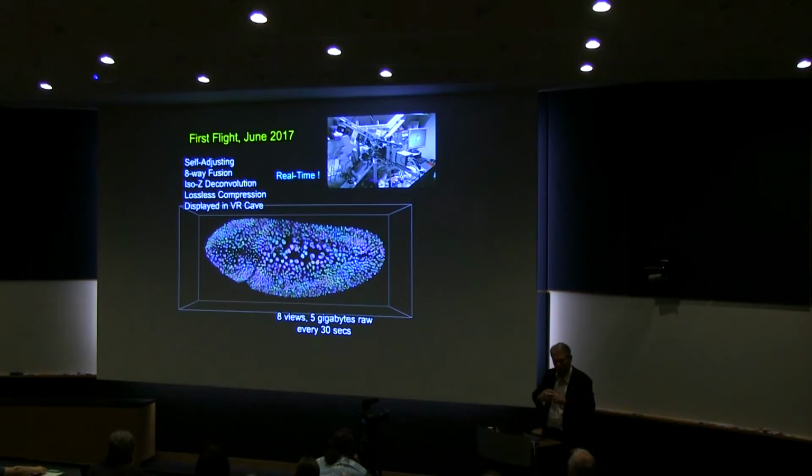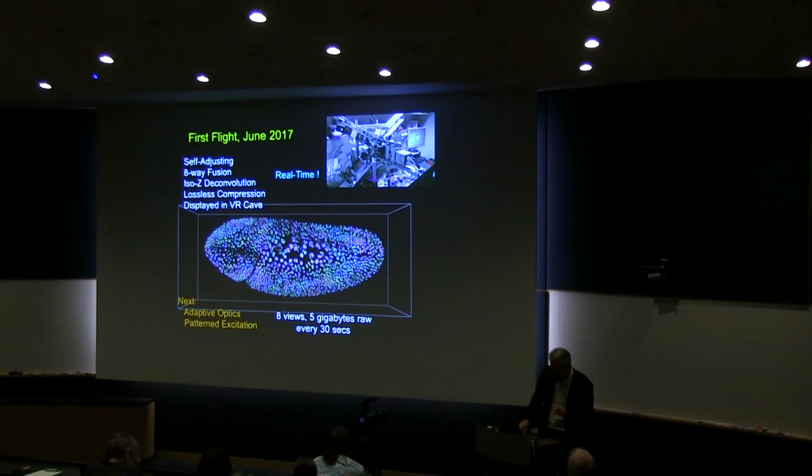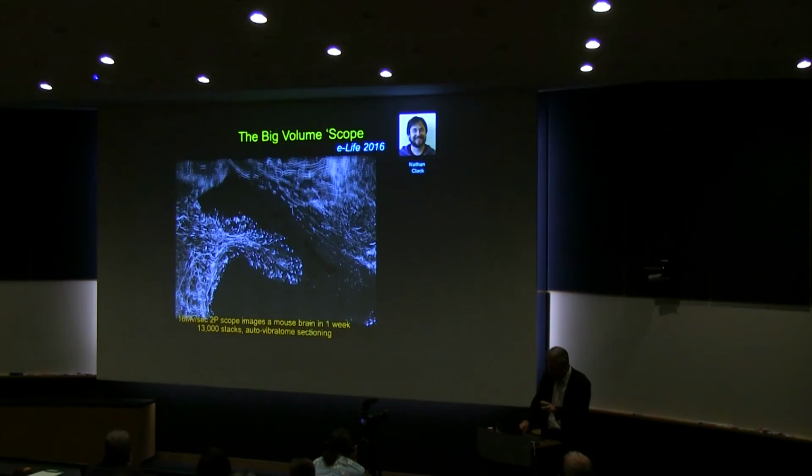But the main thing is, again, it's the computer science thing. We're taking 8 views, we're fusing them, we're doing the deconvolution, the compression, everything, and sending it downstairs and reconstructing it in real time, right? And we can actually watch our stuff in real time. None of this turning on the microscope, getting some data and 2 days later looking at it. You turn on one of our microscopes, you see the data the instant you turn it on, okay? From the moment you turn on, we have a real 3D interactive thing, okay? And we're working on using adaptive optics and ideas of patterned excitation to get further, because we need to get further. Let's see, I think the neurobiologists might be interested in this.